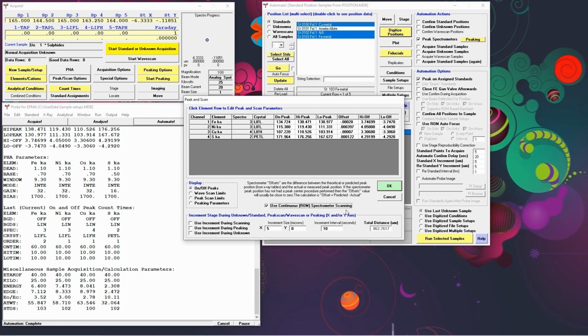What the continuous spectrometer scanning does is it drives the spectrometer at a speed which means that over the interval you've counted for the allocated time. There's a limit to how slow or how fast you can do, which is dependent on your instrument, but most instruments are actually quite versatile in how wide a range of settings they can use.